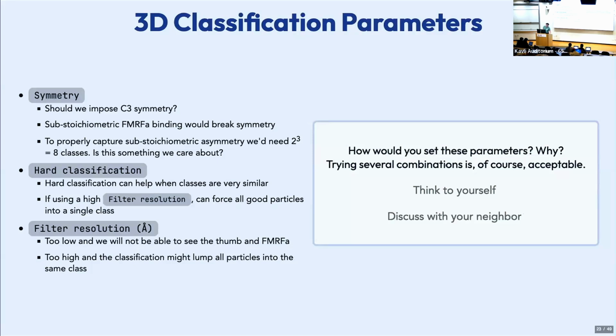Awesome. I'm sure that you all came up with great ideas for the jobs to set up. I just want to emphasize that there is certainly no right answer to these questions. Basically any combination of trying this on and this off and this filter resolution and that one would be right, in the sense that you learn something about the sample.